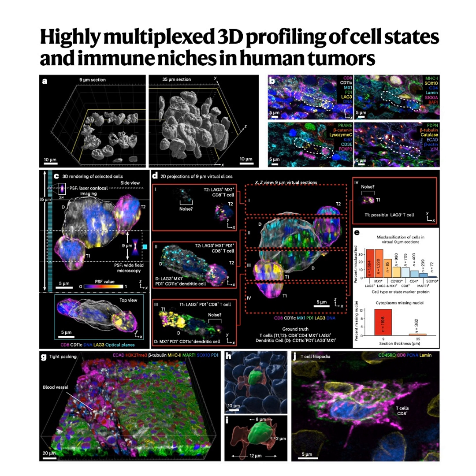So you've got a thick slice, preserving more cells, but how do you see through it clearly? Isn't it blurry? That's where the second part comes in. They incorporate optical sectioning using high-resolution confocal microscopy. Confocal microscopy is a crucial technique. Unlike a standard microscope that collects light from the entire thickness of the sample at once, a confocal microscope uses pinholes to actively reject light that's out of focus.